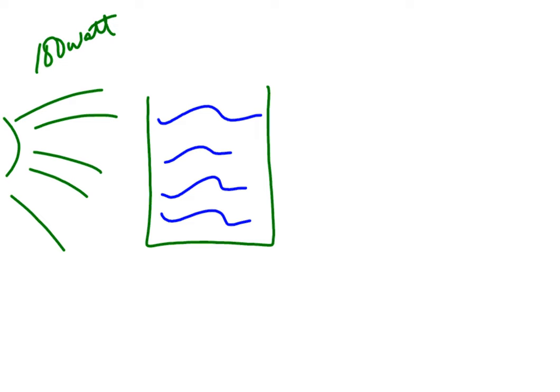The reason why we have the water in it is because my cuvettes are going to be over here. I'm going to have 3 cuvettes. Obviously, they're not going to be stacked in front of each other. They're going to be next to each other where they're all exposed to the light. Remember, one of them is going to have a Dixie cup over it, which would be our dark one.